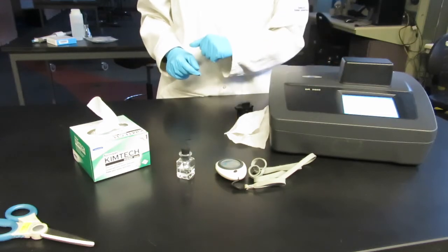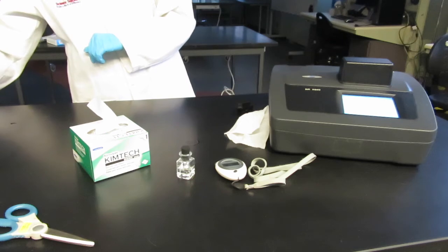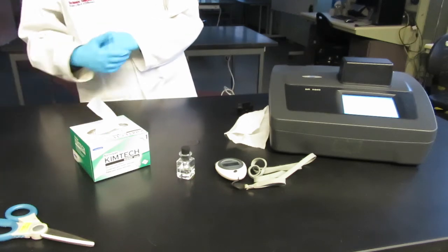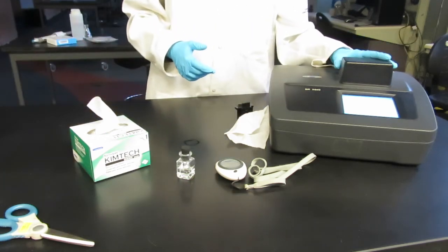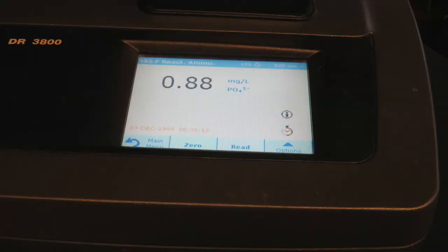Insert the sample cuvette into the cell holder, cover with a light shield and press read. The value displayed will be milligrams per liter of reactive phosphate.